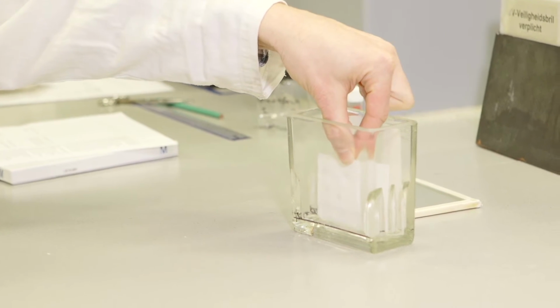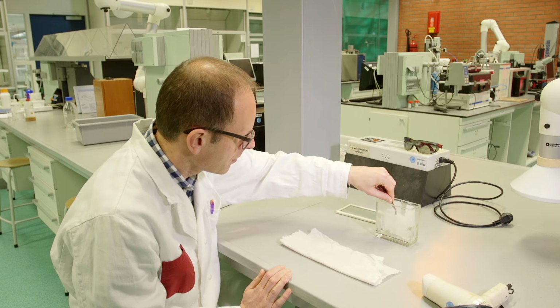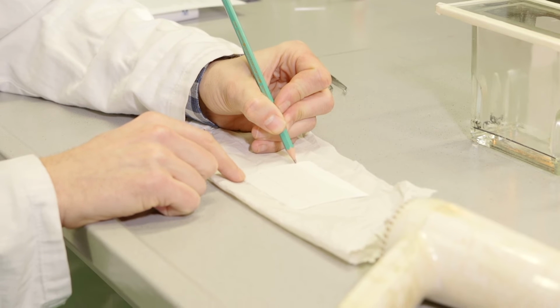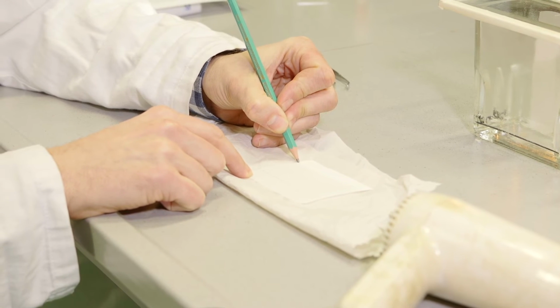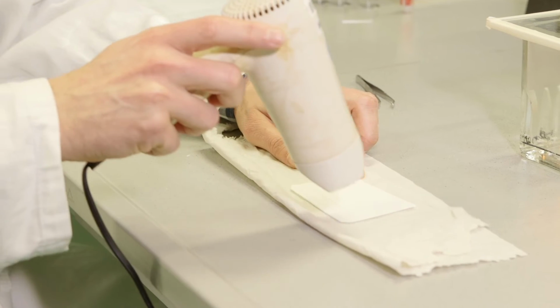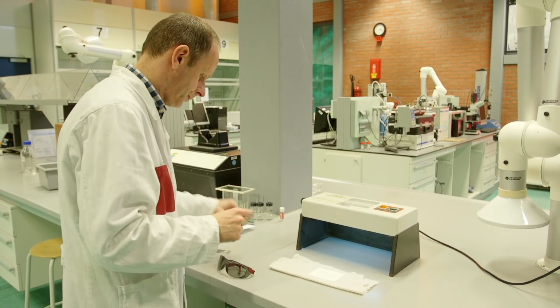The TLC plate is carefully placed in the tank. When the solvent reaches 1 centimetre under the top edge, the plate is removed from the tank with a pair of tweezers. The front of the solvent line is immediately marked with a pencil. This is important in order to determine the RF value. The plate must be dried. You can do this in the air or with a hairdryer.